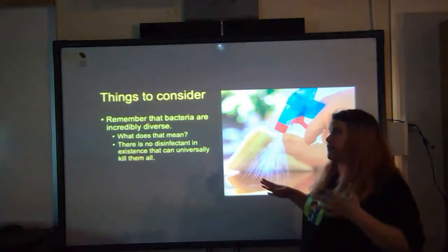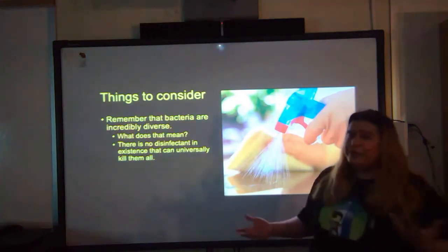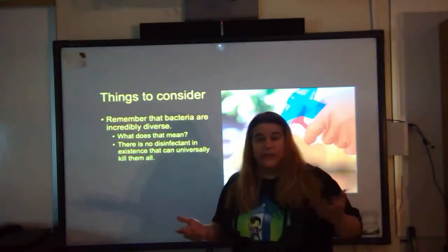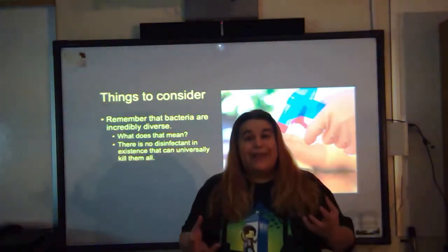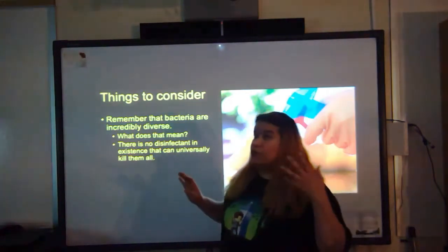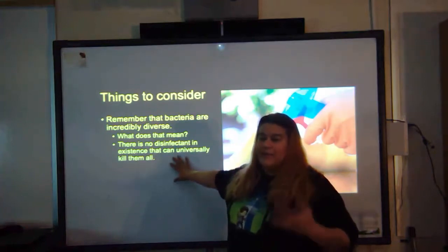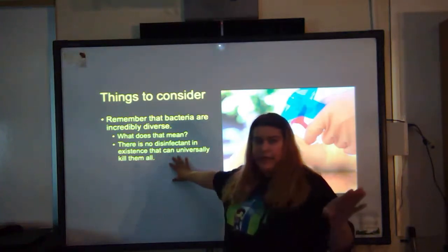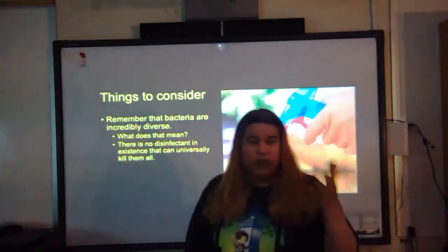Something to consider. Remember, bacteria are incredibly diverse. Every bacteria is not the same as every other bacteria. With that in mind, just like with antibiotics, there is not one disinfectant that will kill everything. I understand Lysol says that it'll kill 99.9% of germs.